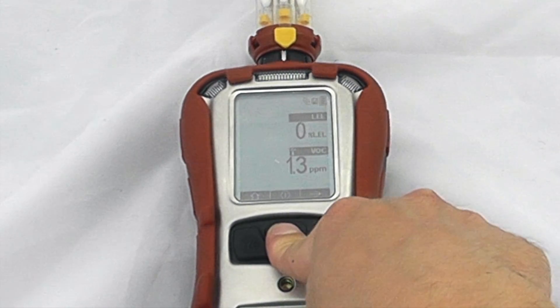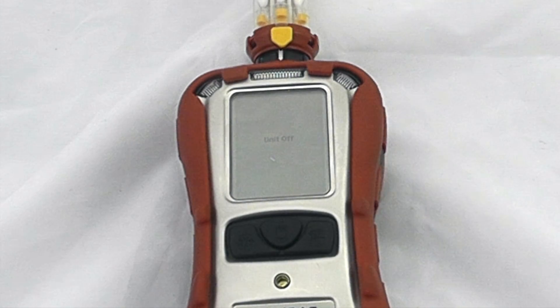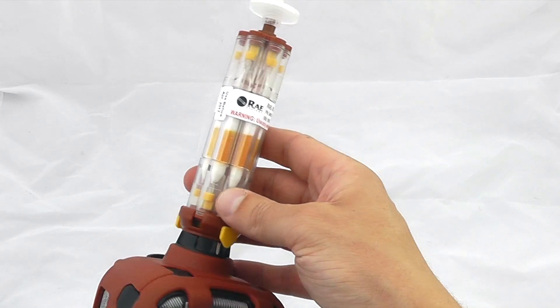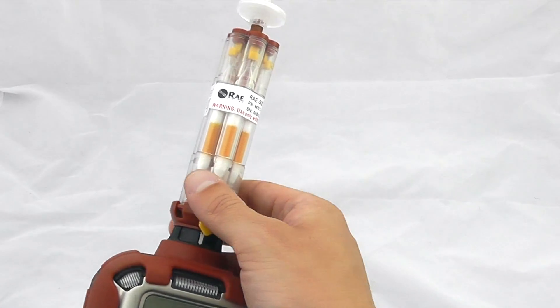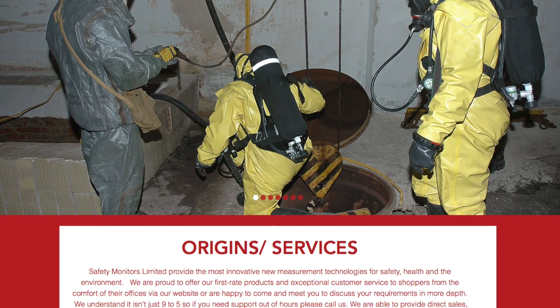To switch the instrument off, select turn off. If you want to look at the Multi-Ray in more detail, take a look at our Multi-Ray video also on our YouTube channel — it goes through some of the menus in more detail. Hopefully this gives you a good idea of the Multi-Ray Benzene's functionalities: the multi and benzene sampler at the top, the removable tubes, the tube samples at the top is the key difference between this and the general Multi-Ray instruments, along with the lower voltage lamp. This can also operate as a general Multi-Ray device without the tube assembly on top.